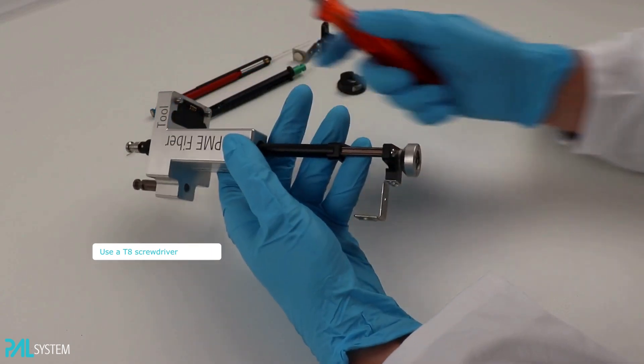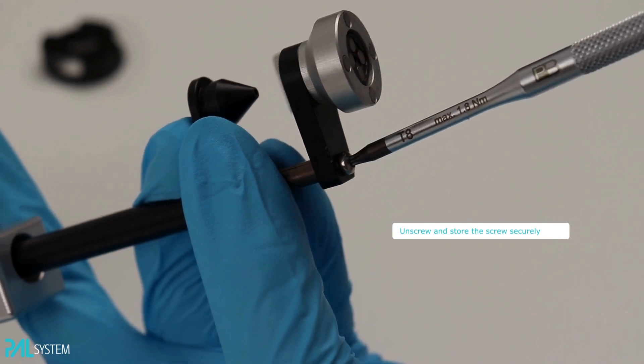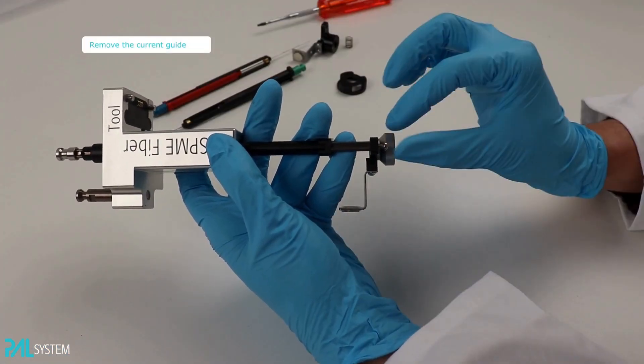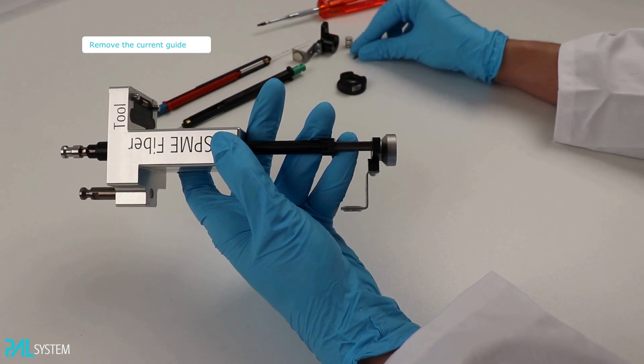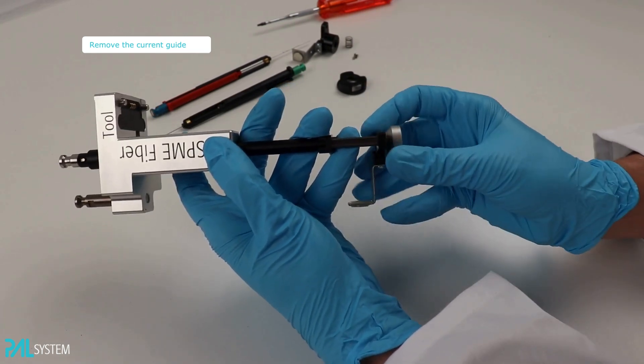Keep a firm grip around the tool and be mindful about the parts that are moving. Once removed, place the screw in a safe place as you will need it later again. Loosen the current guide from its position and set it aside.